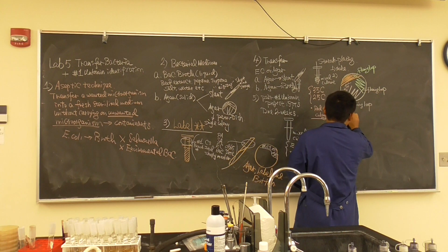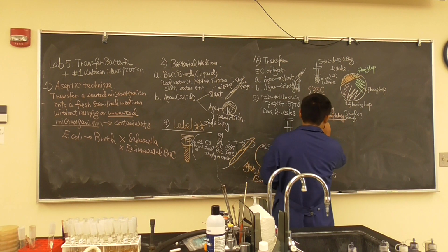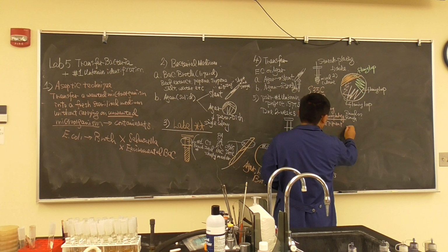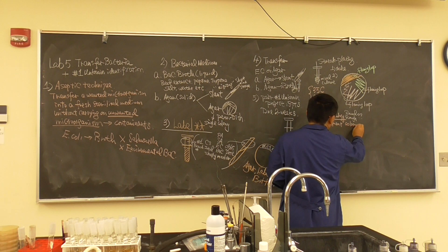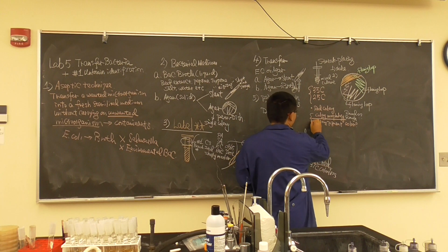So, is that round, for example? Is that rough? These are the things you're going to find. And also the pigment, that's simple. Colony pigment. What is the color? Is that red or colorless? Okay, those are the things we want to talk about.